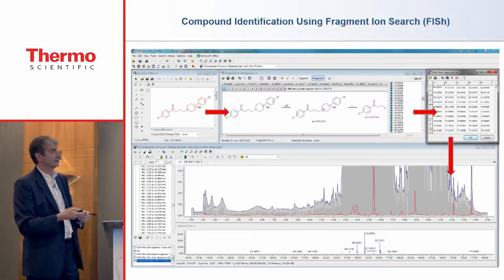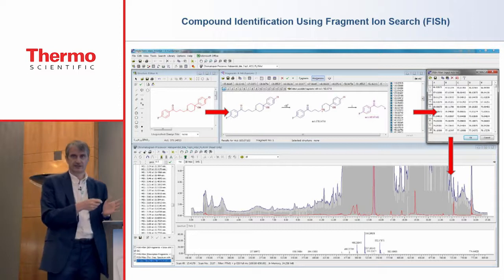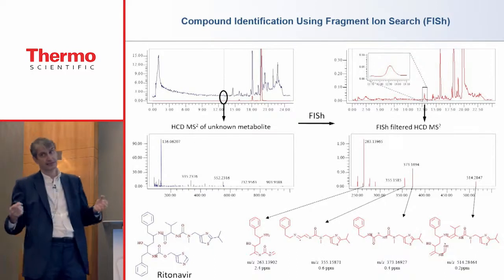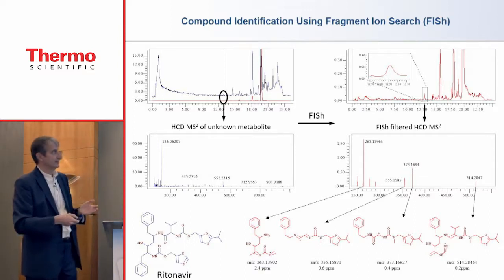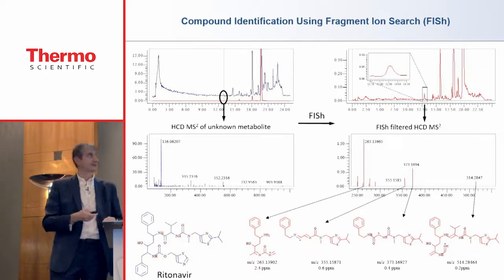The advantage of this method is not only that it shows you the peaks that are related with your investigated compounds, it gives you also some partial substructural information. And then, I have to admit, you have to put it manually together and make sense of all these results. But at least you can see what kind of substructure belongs to which chromatographic peaks.